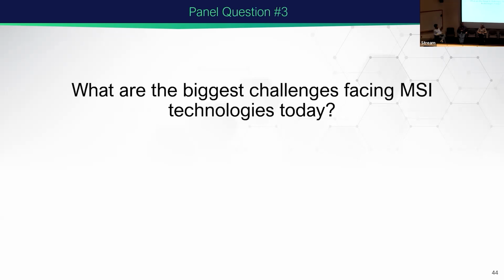David said he found 40 algorithms before he got tired in 10 minutes or something, but I'll bet you 39 of them don't work. Yeah, it's not a trivial problem. Just because something was published doesn't mean it's necessarily directly applicable to what your samples will actually be. It's a very big challenge.